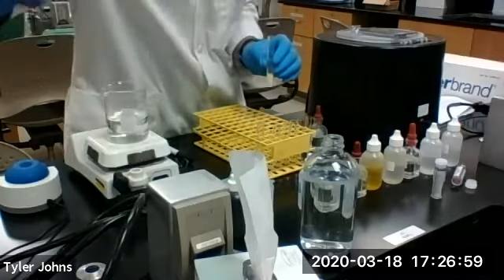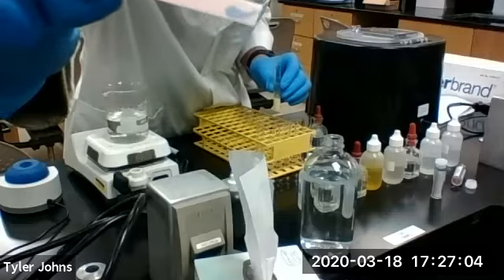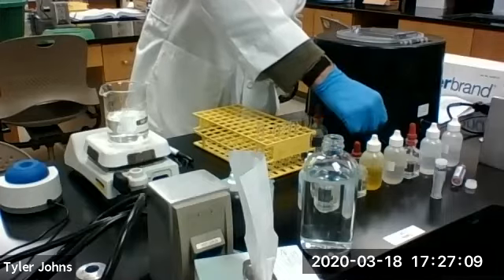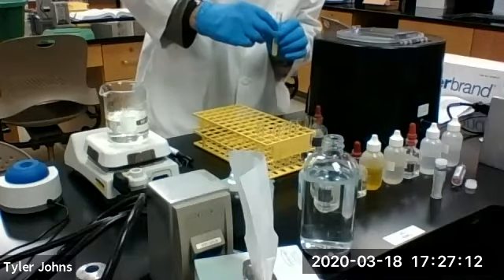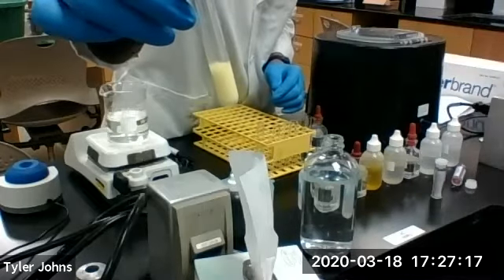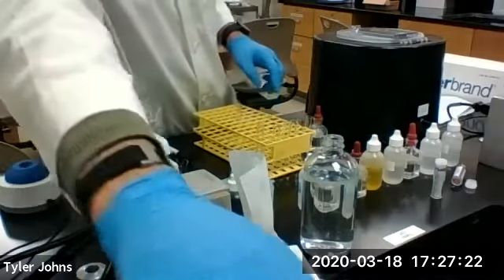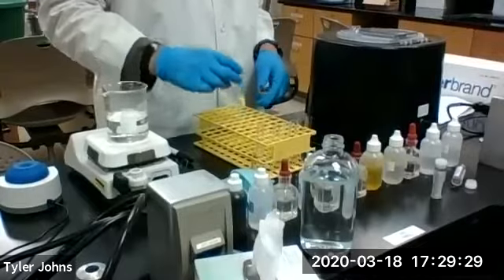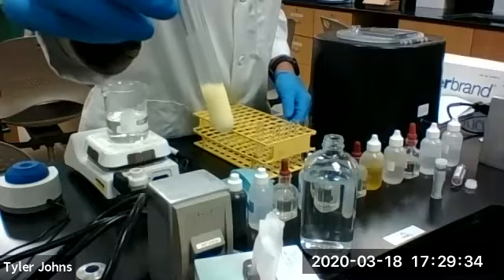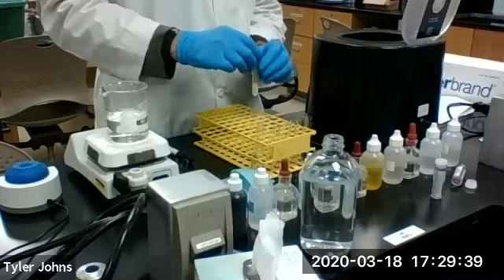Okay, our solution is now basic. We're now going to let this stand for 10 minutes for the precipitate to form. Okay, at this point, we have a significant precipitate. You can see. We're now going to centrifuge this to check the color of the precipitate.